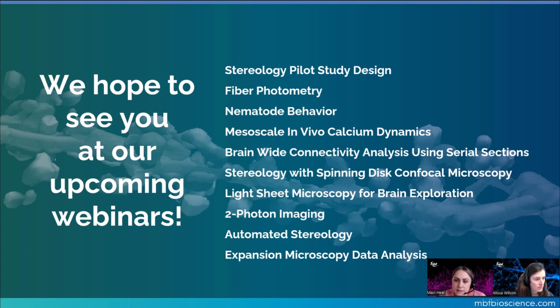So there's certain criteria that I adjusted here in the demonstration, but there's even more advanced settings that you can adjust depending on the quality of the image data to address maybe more complex situations. And the image that we use today, we did use the background subtraction filter. Yes, that too. To help as well. So yes, yep, absolutely.